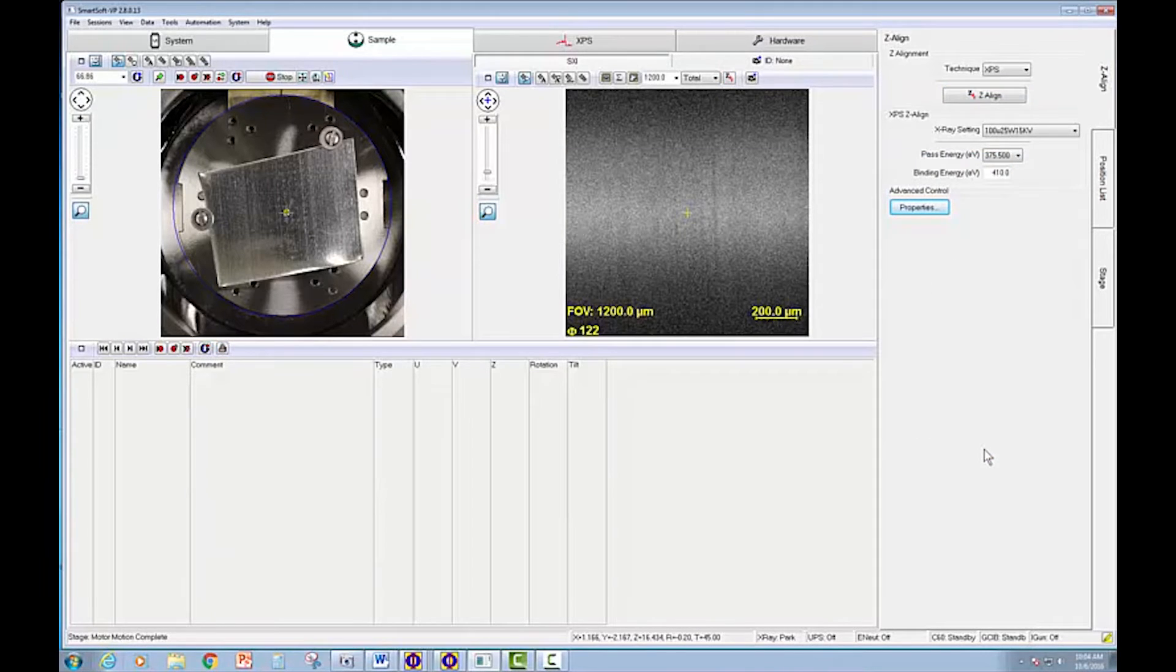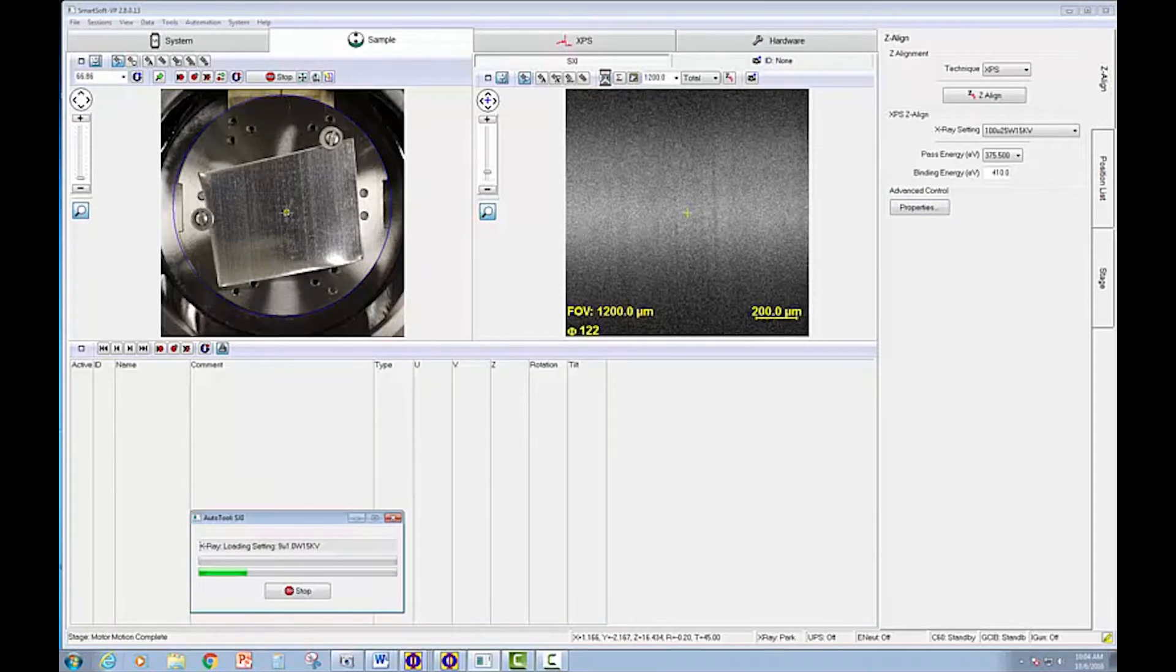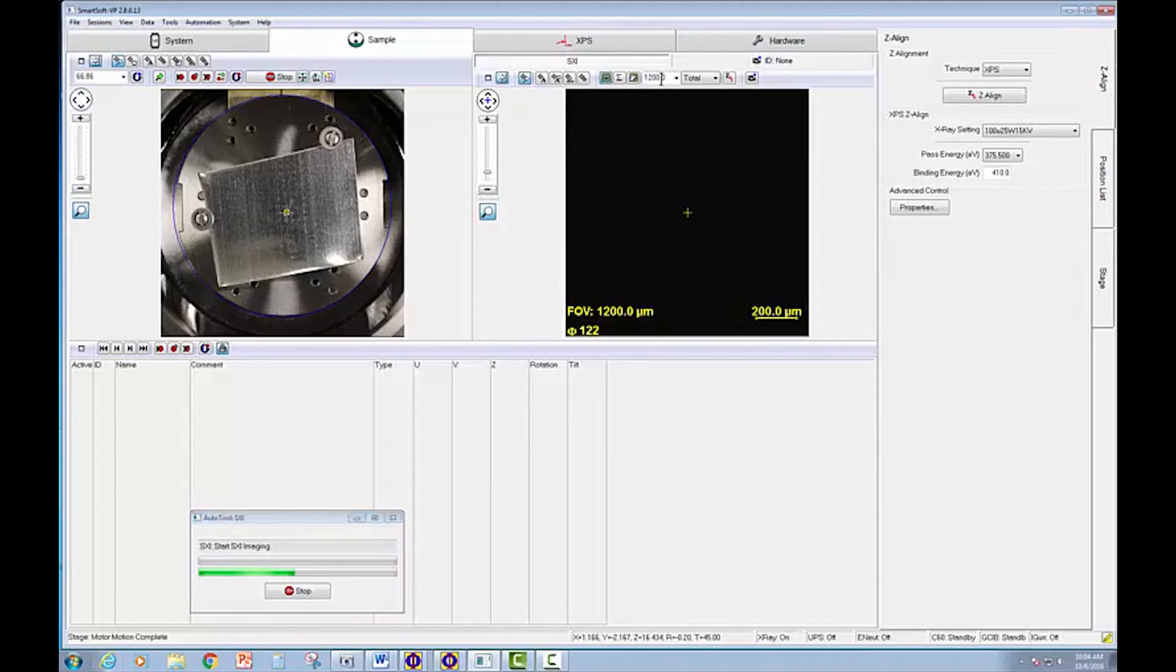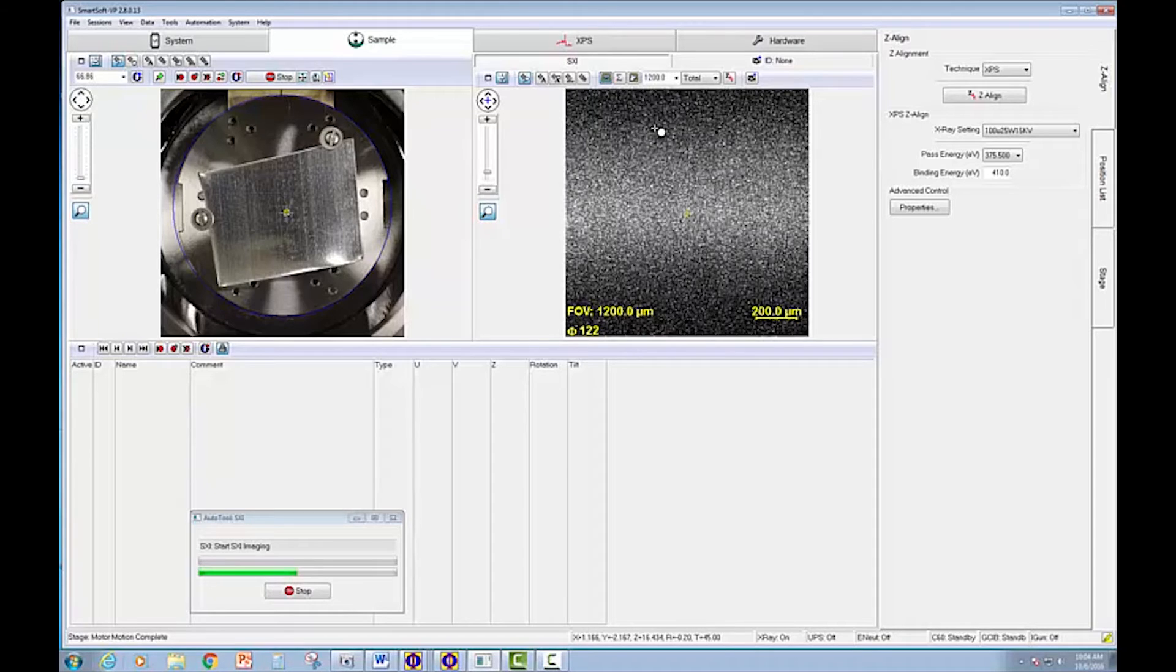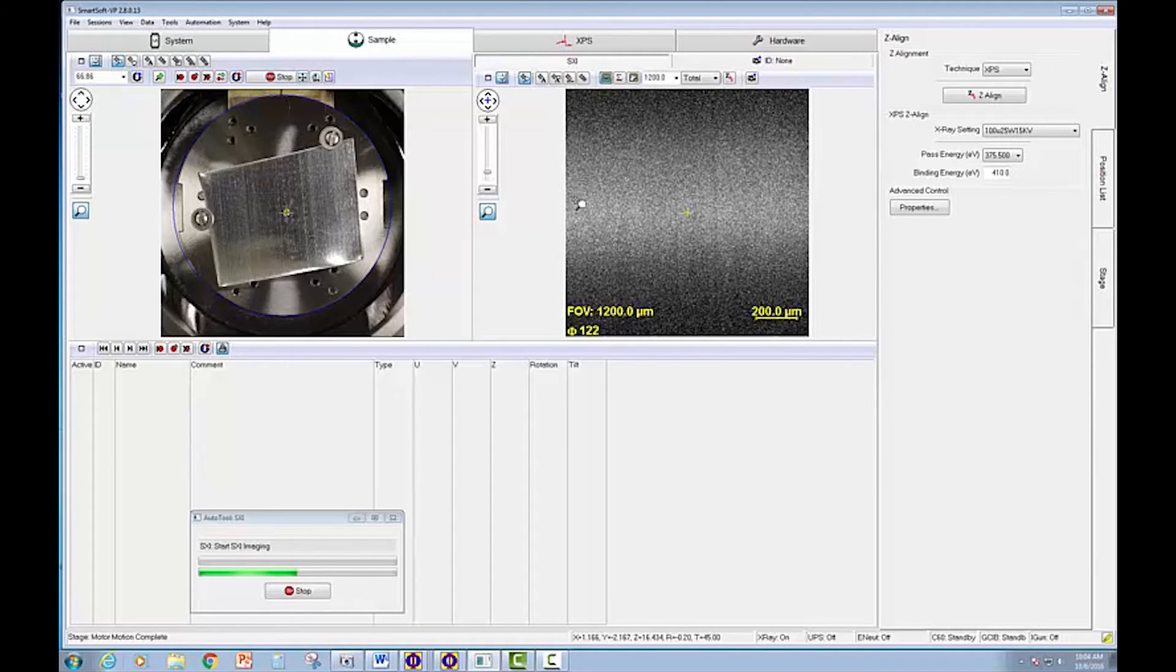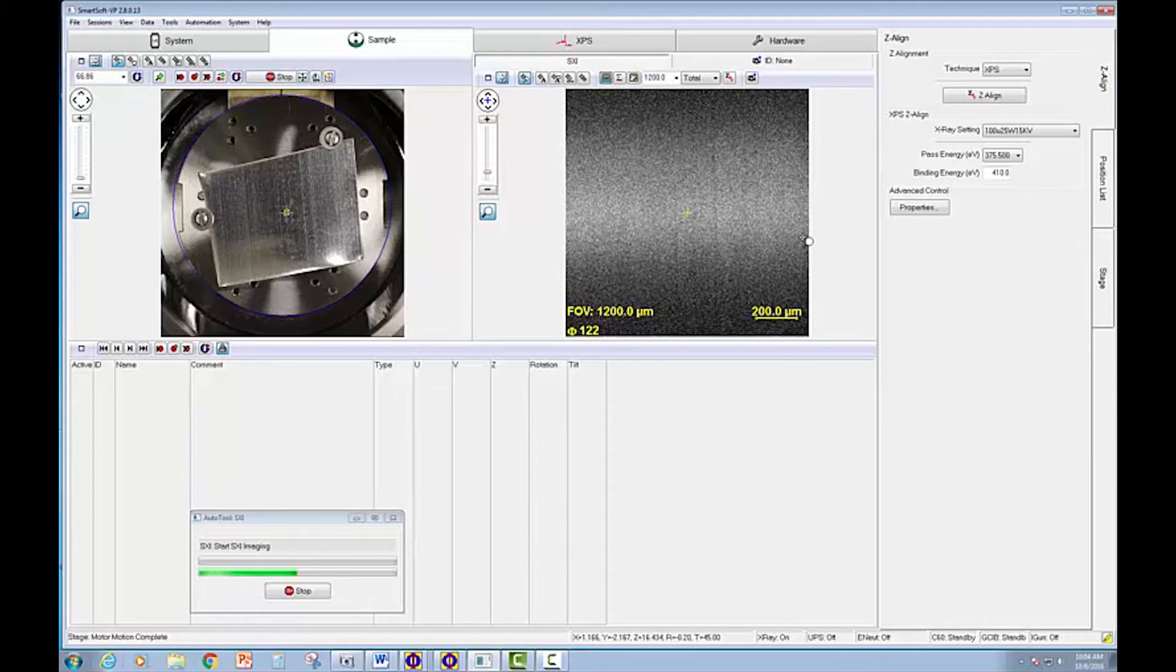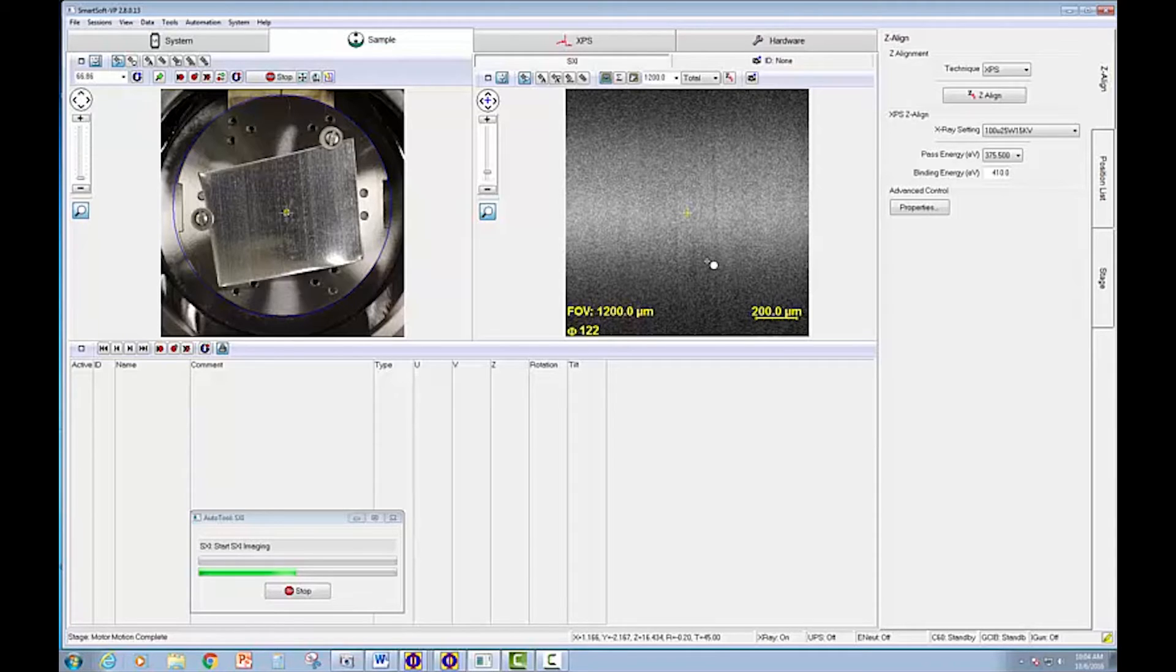So the instrument is finished Auto-Z. I'm going to turn on an SXI image. I've got a fairly large field of view right now, 1.2 millimeters. And in the current field of view, the SXI is showing the composition is relatively uniform. We can see some of the striations in the metal, the physical imperfections.